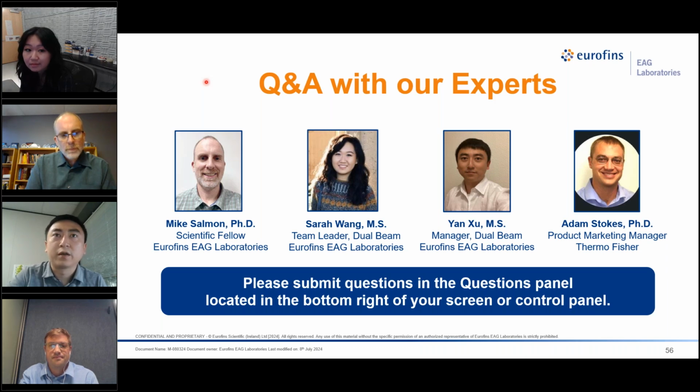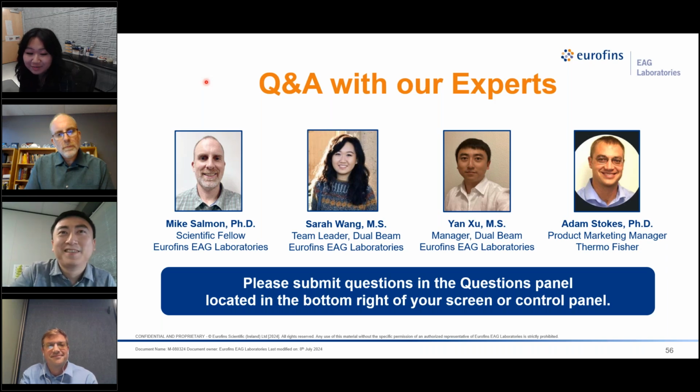Okay, thank you, Mike. Sarah, there's a client asking, do you have any comments regarding using in situ etching to enhance contrast between different materials? It's more the same question.